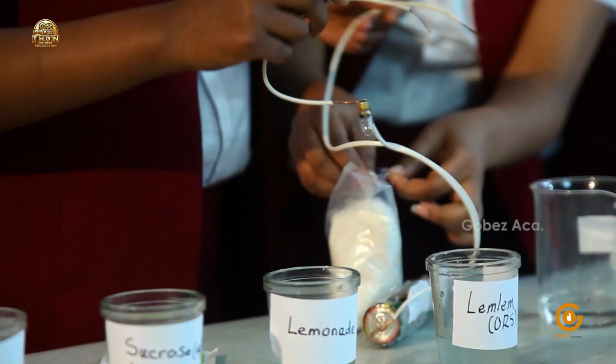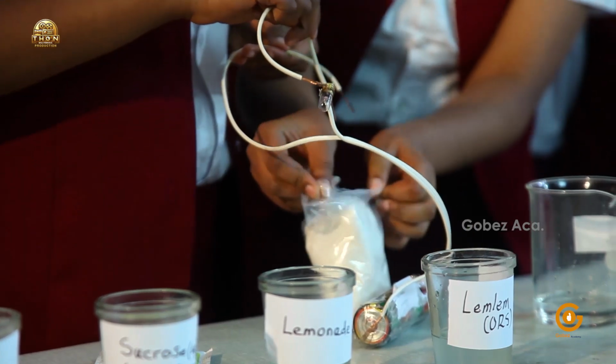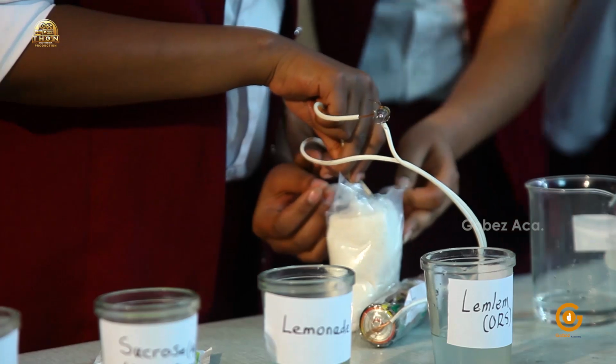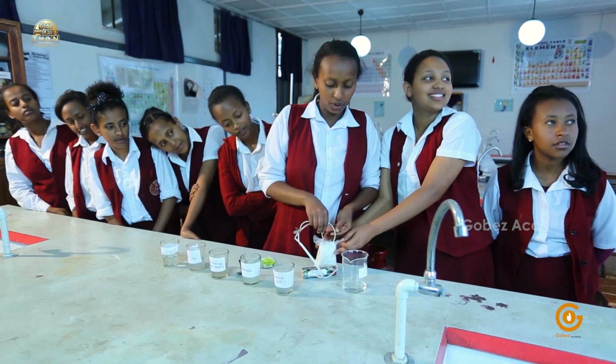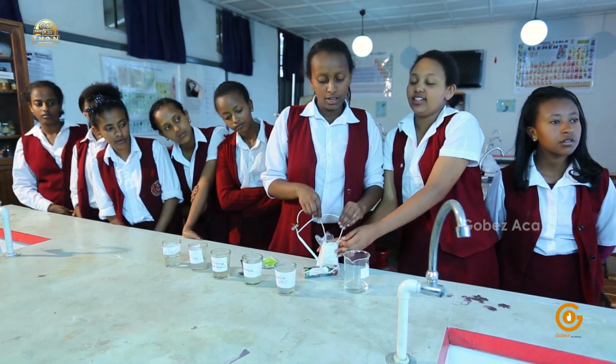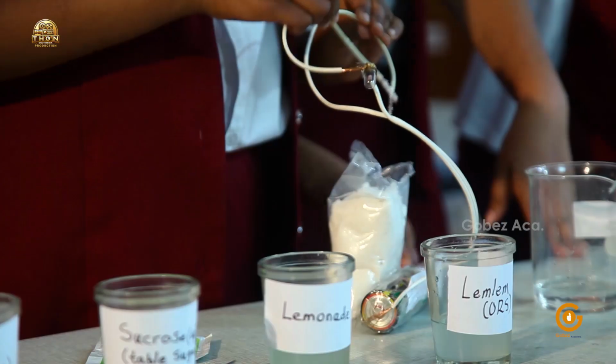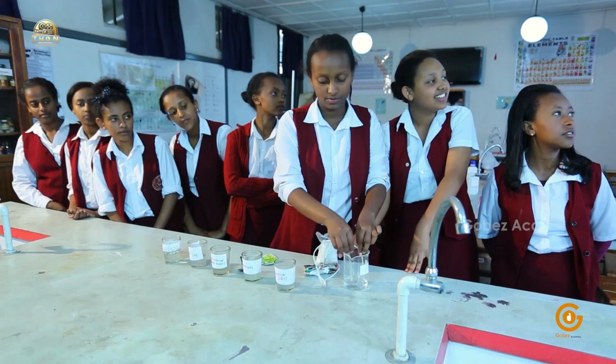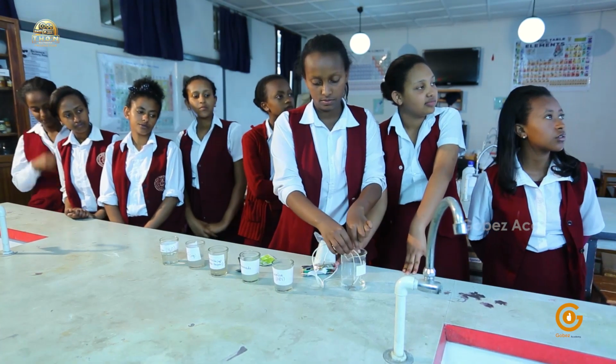See how bright the light will be now. Dip it. Immerse. Wow, what happened? There's no light. Why not? This is sodium chloride. Because it's not dissolved, or it's not in its aqueous solution.